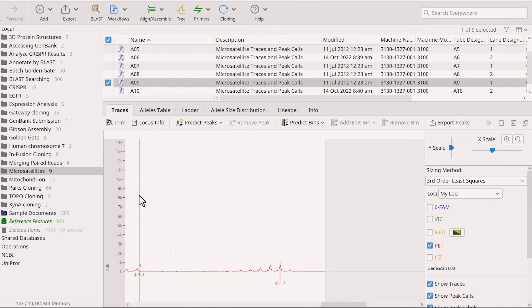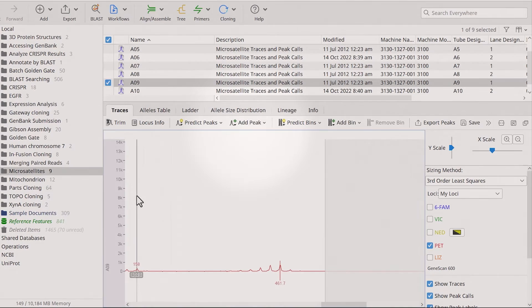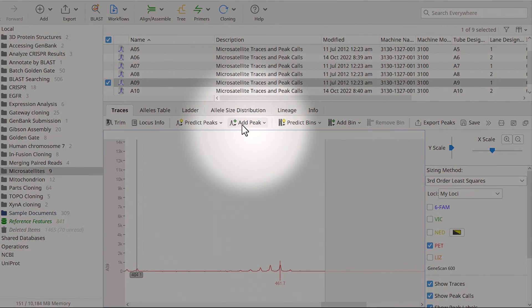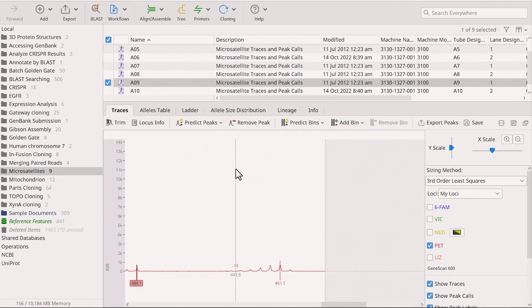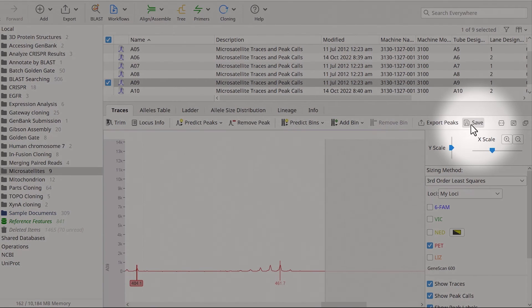Ensure you also add in any missing peaks that should have been called by selecting a peak and choosing Add Peak. Once done, remember to save your changes.